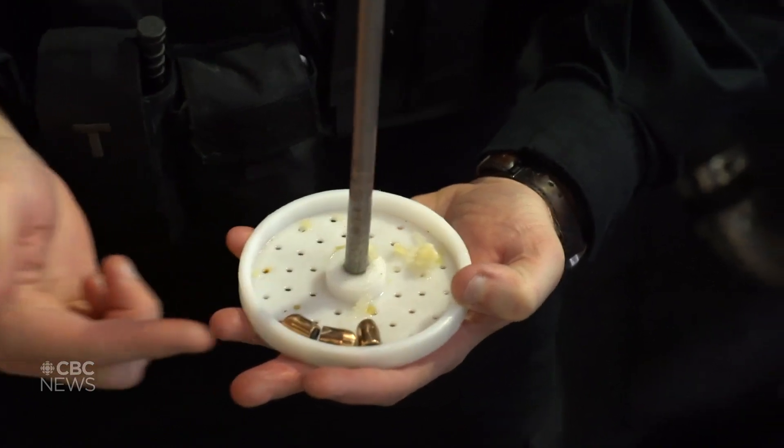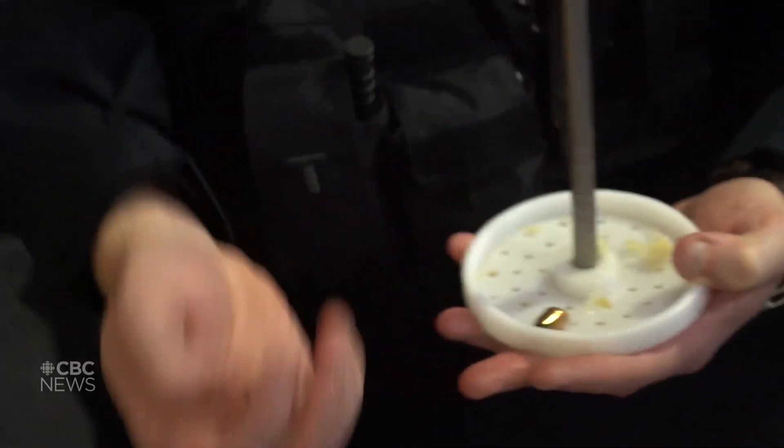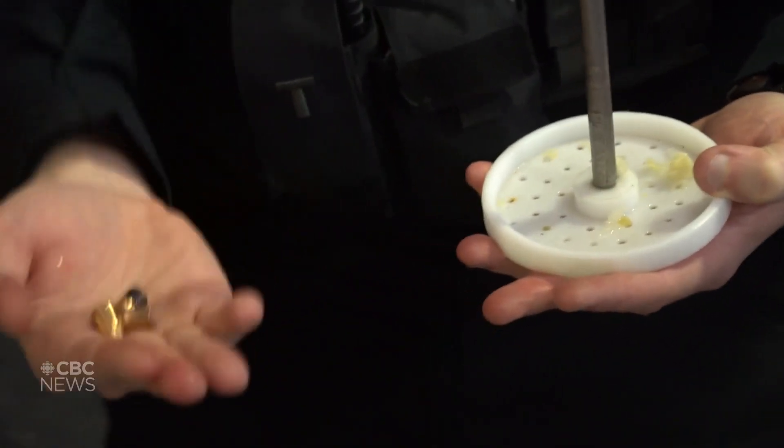Every time a firing pin strikes the primer on a cartridge, it leaves a mark. Every single primer, when you look at it microscopically, leaves an individual mark on every cartridge case, as well as the projectile that goes through the barrel. There are lands and grooves down that barrel, and those leave individual marks on each bullet. Samples can get uploaded in a microscopic way onto our database, and that's how they are able to essentially determine the fingerprint of each gun.